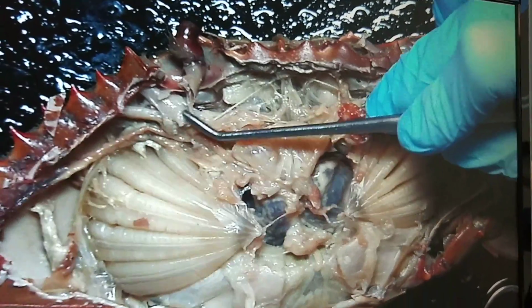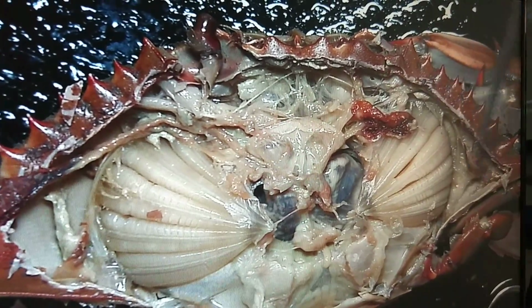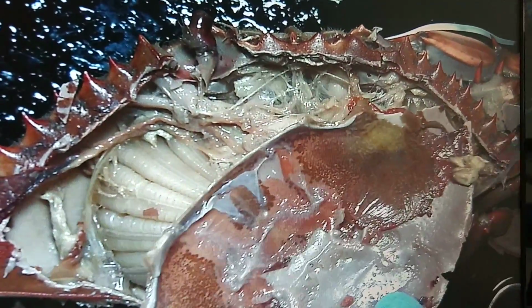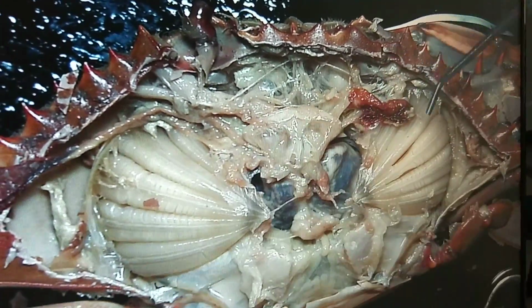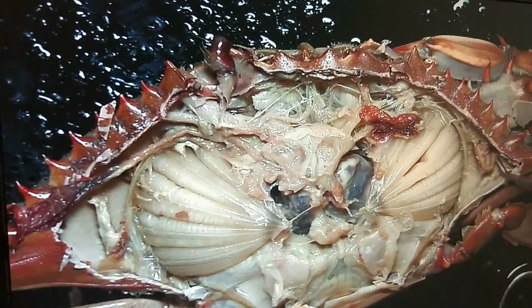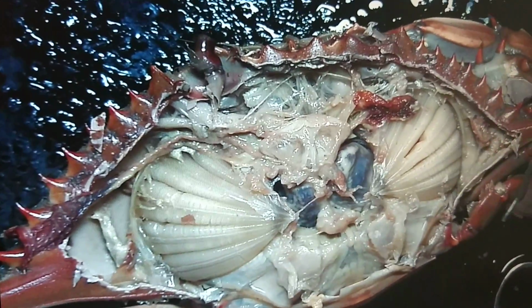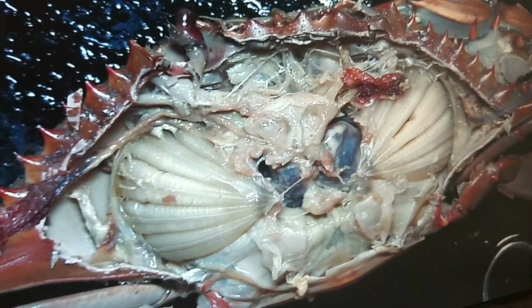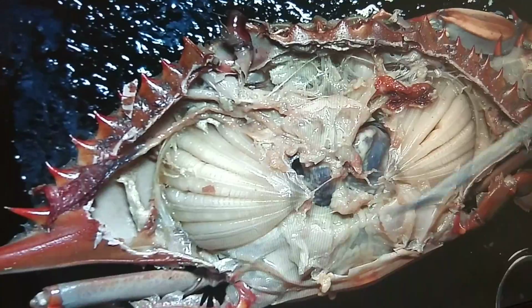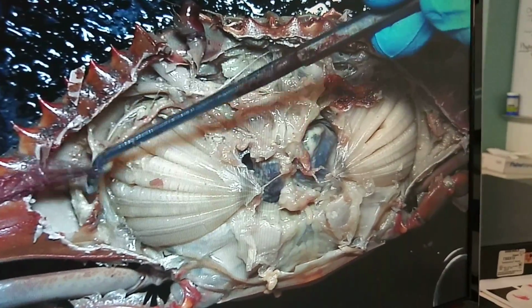Okay. And the ovary is. The digestive gland you really can't see here, because I think that's probably part of it right there. It's the brown gooey stuff. But there really wasn't a lot of digestive gland in this female for some odd reason. If it was a male, it would have something else. That's the vas deferens. So this whole area right here would be super busy and full of super convoluted tubes for the vas deferens if it were a male. The ovaries are thinner, basically. They can be, yeah.